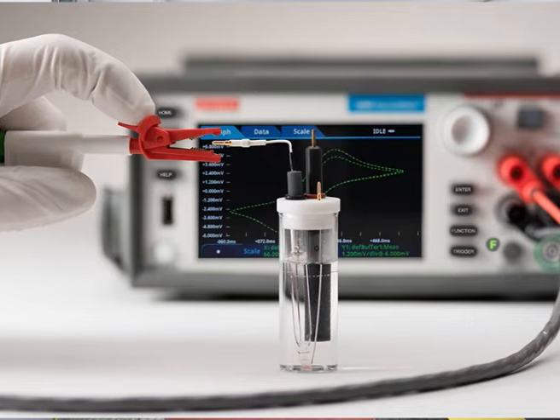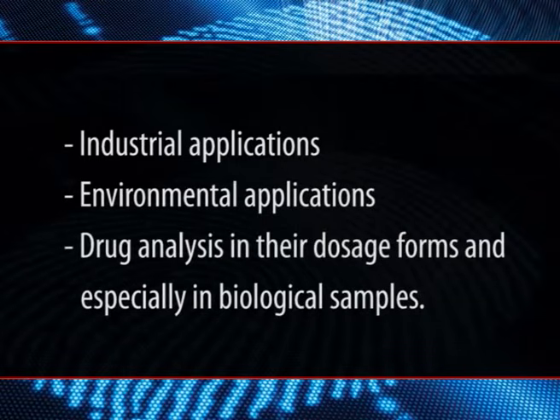These electro-analytical methods are very dexterous methods that offer accuracy, precision, and sensitivity with relatively low cost instrumentation and experimentation. These methods have a wide variety of applications such as in industrial applications, environmental applications, and drug analysis in their dosage forms, especially in biological samples.